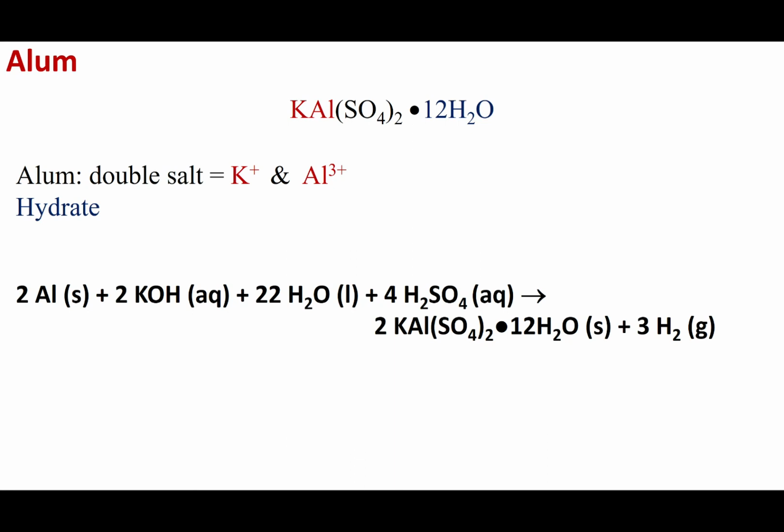Alright, gentle people, let's go ahead and give you some background about this lab. In this lab, you're going to synthesize alum. Now, alum is what we consider a double salt crystal.